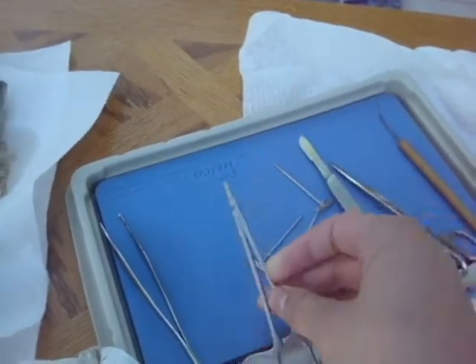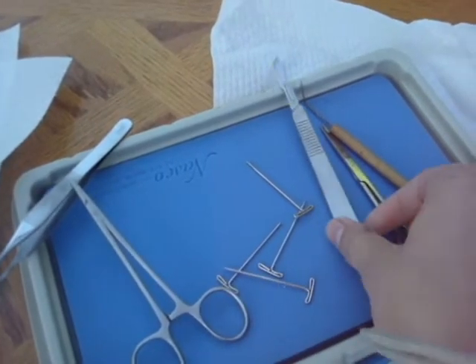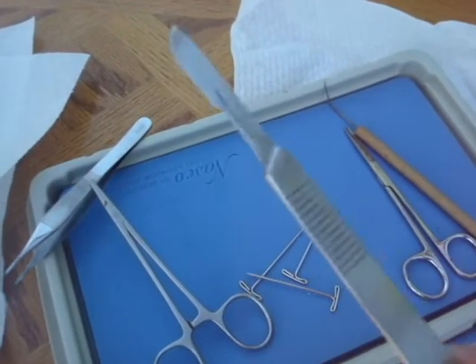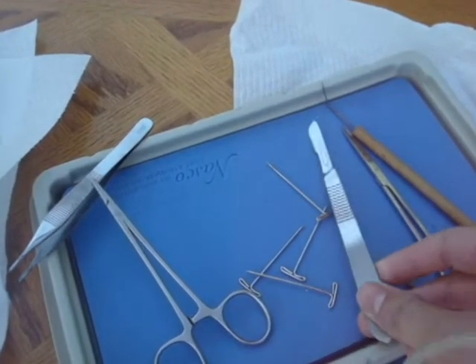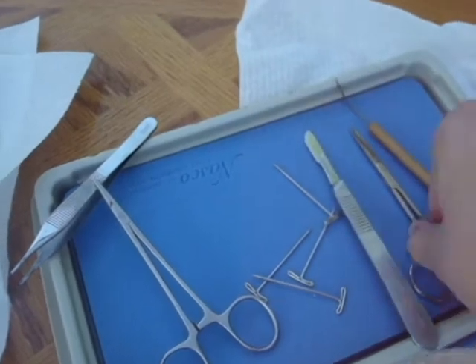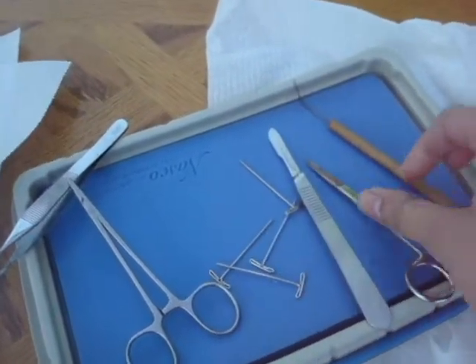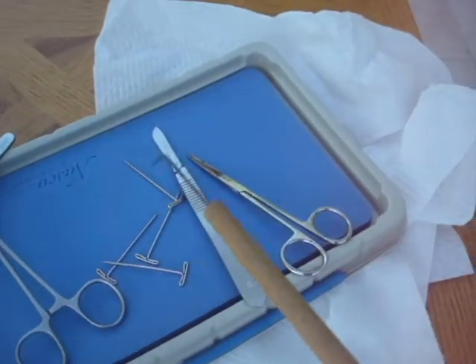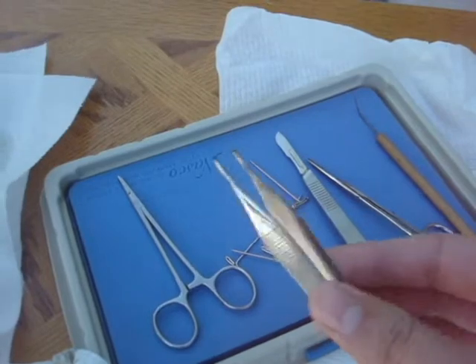Our necessary instruments are these forcep hemostat — that would be the correct name for it. These are surgical pins. This is a scalpel. It's one very, very sharp knife and it cuts really deep, so I would try and keep this away from you. Our standard regular scissors. And this is good for pointing and poking stuff — a dissecting forcep.